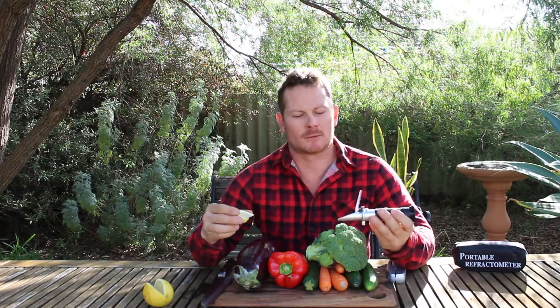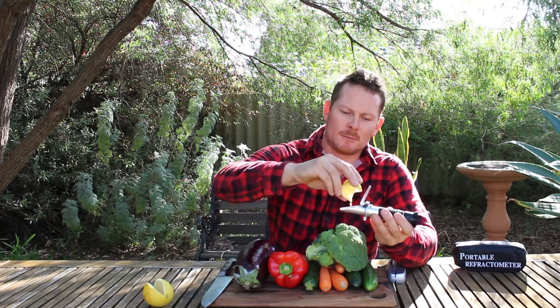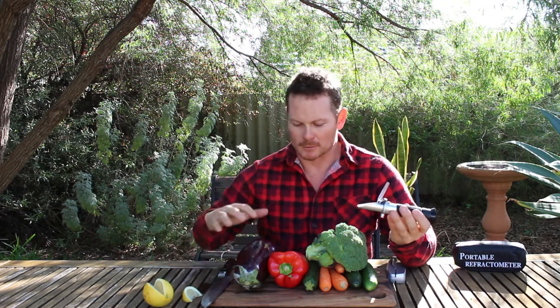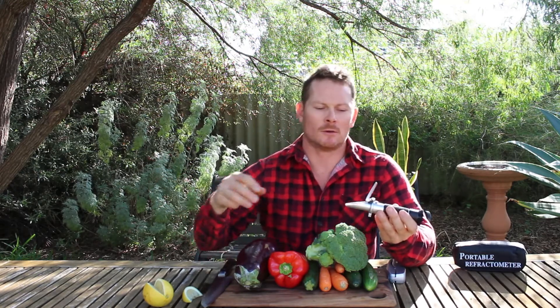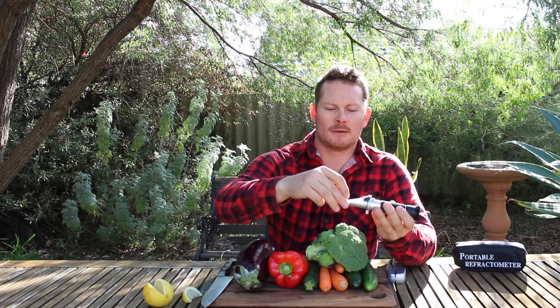It's really simple to use. All you're wanting to do is get a couple of drops of the produce liquid onto the lens. Whichever one you're testing — this is lemon — so it's really easy to just squeeze a couple of drops. For anything else like eggplants, carrots, or zucchini, you might need to juice it. You can use a garlic crusher for things like tomatoes, spinach, or other produce. Then just close that flap.